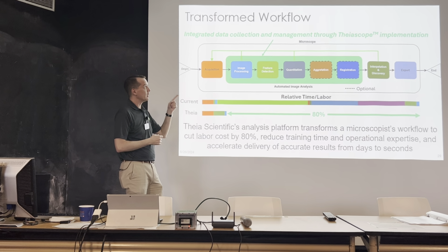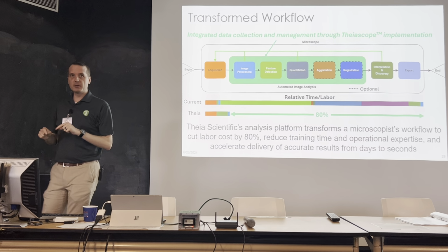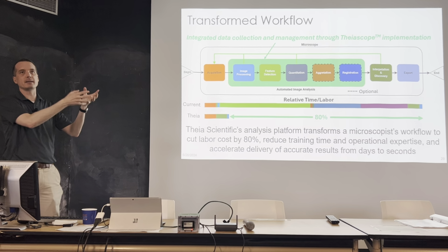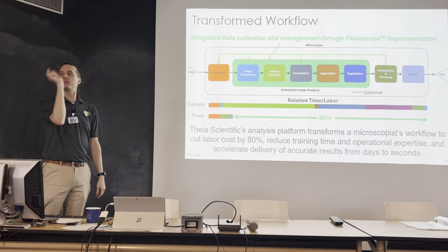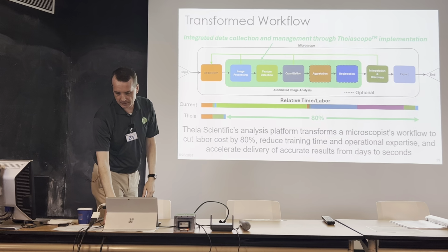But then also, we said, hey, can we do this at the microscope, as opposed to doing it in the post-acquisition workflow where we collect it, then we come back to our computers later on and do the analysis? I want my publish-my-paper button right in my microscope. That's kind of what we set out to do in that case.